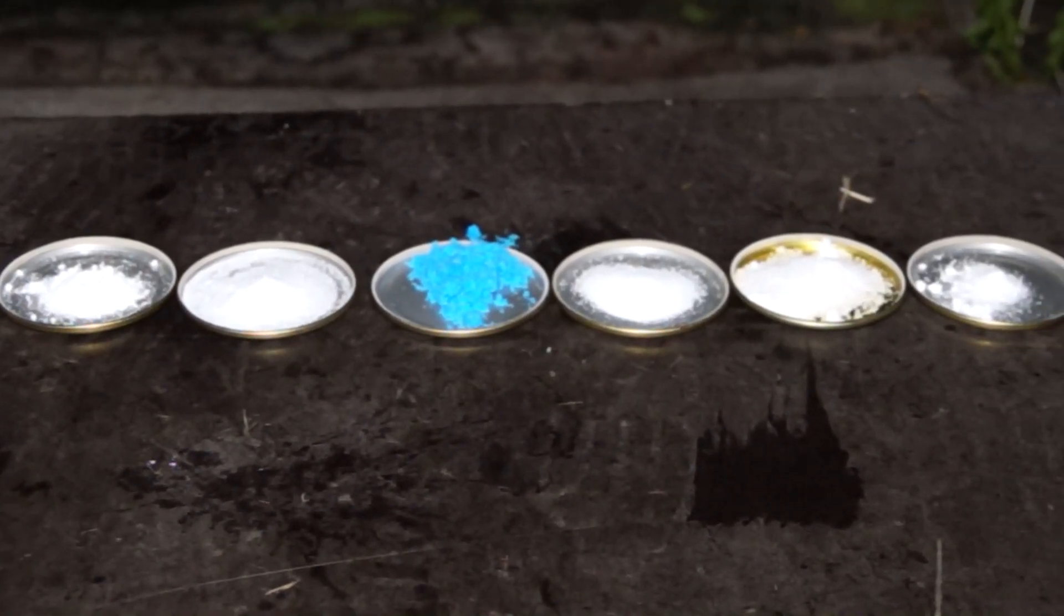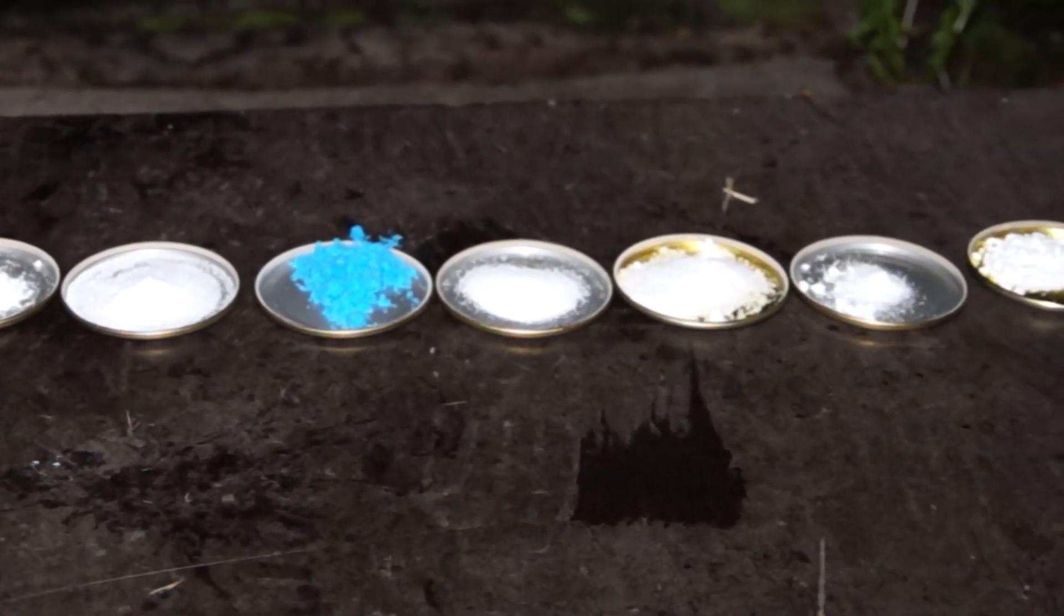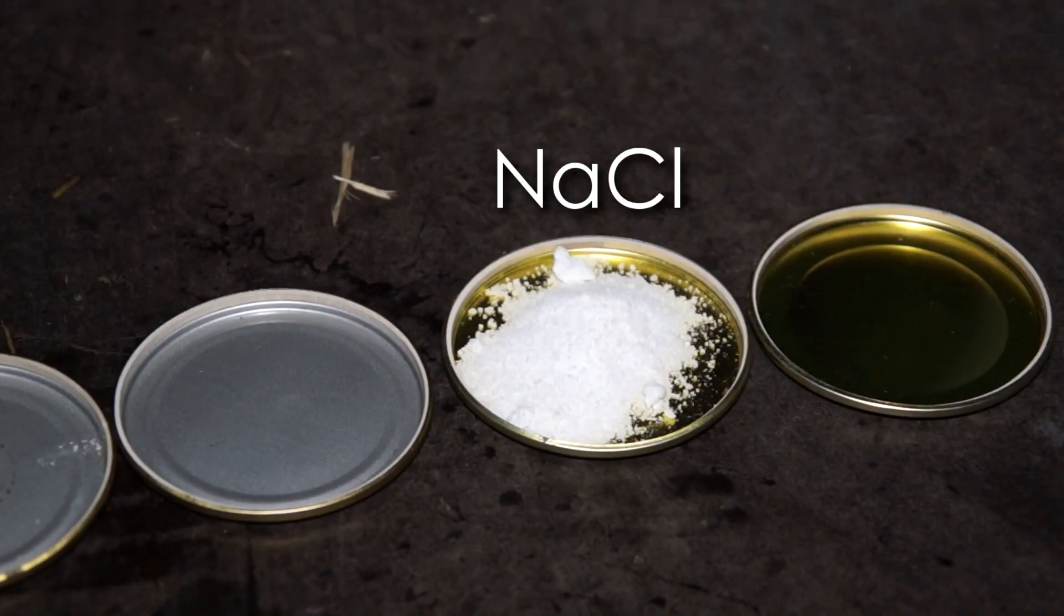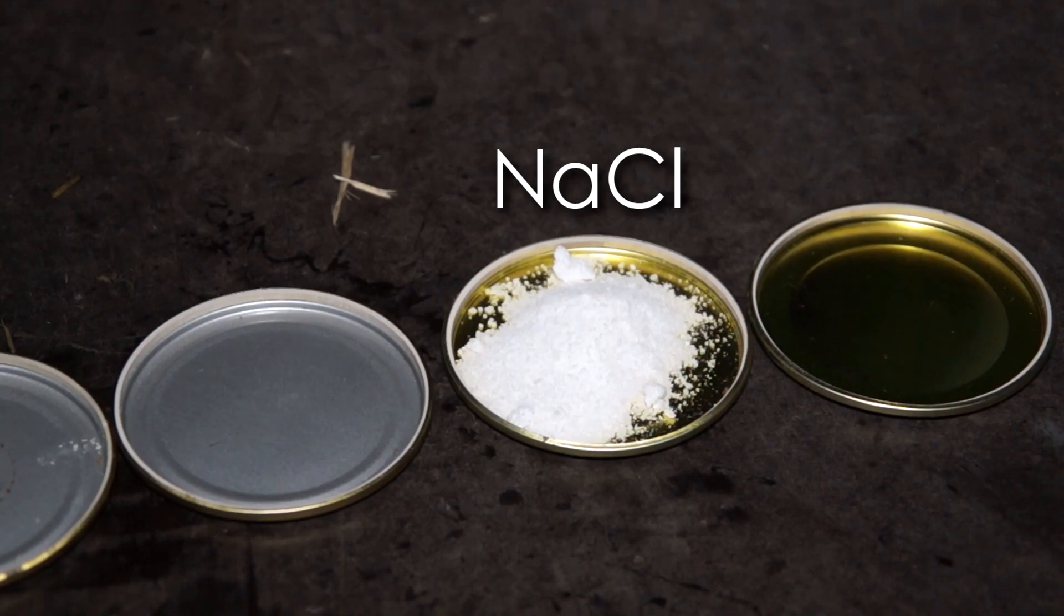For this experiment we will need different metal salts that will paint flames in different colors. The first ingredient, one that you can find in our kitchen, is cooking salt. It will paint the flame in yellow color.